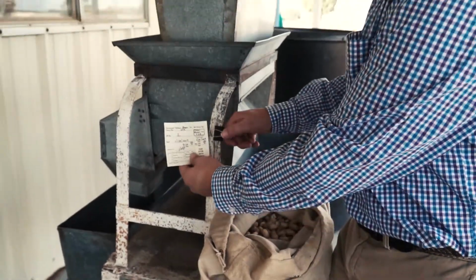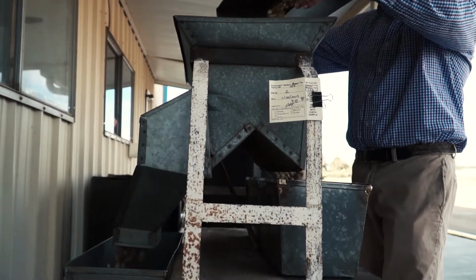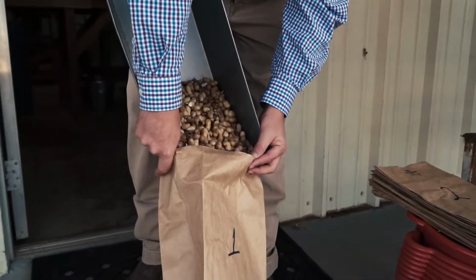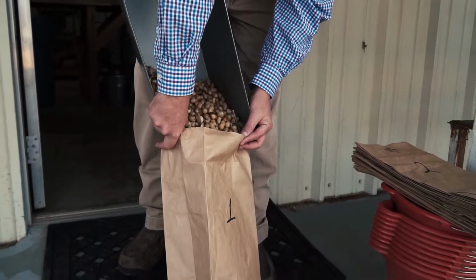The sample is then divided into 2 equal parts. 1. A foreign material sample goes into a container and will be used to determine the grade, or for a routine supervisory check which occurs at least bi-weekly to ensure consistency in grading.